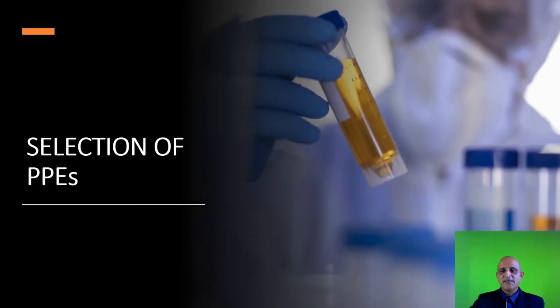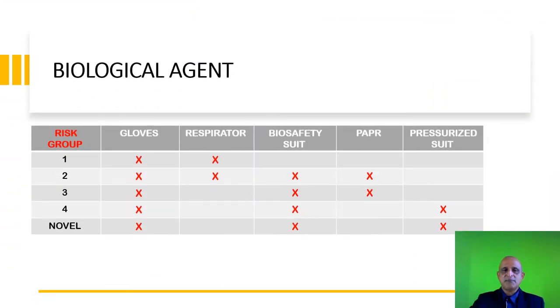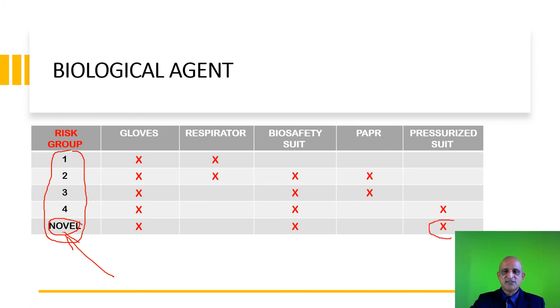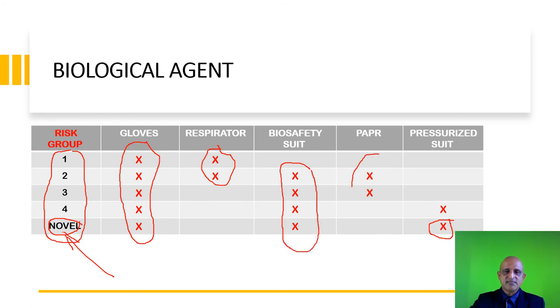We now move on to the selection of PPEs. The selection is based on risk assessment, considering the biological agent itself and the risk group to which it belongs. If the risk group is unknown or novel, we must utilize the highest level of protection, which involves the pressurized suit. The various risk groups and their associated PPEs are listed in a table. Respirators are used for risk groups 1 and 2. However, for higher risk groups, it is recommended that a biosafety suit and a PAPR be utilized in conjunction with each other.